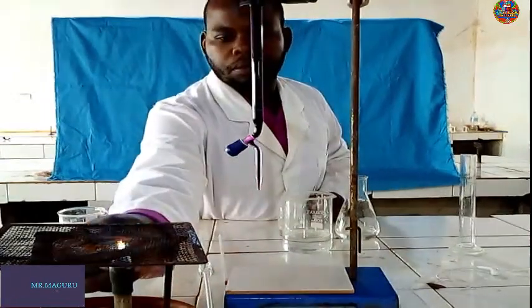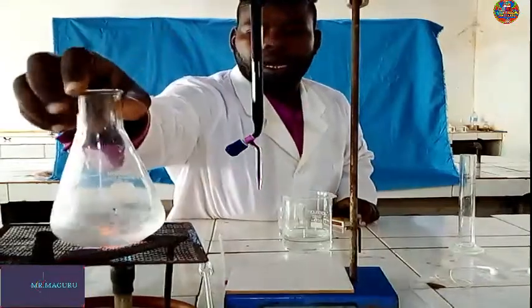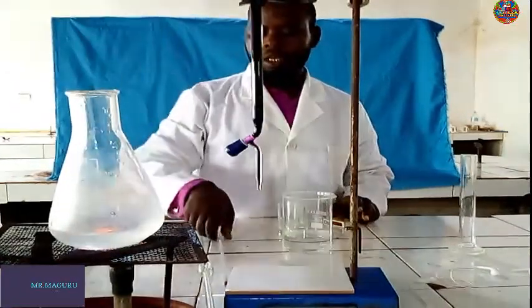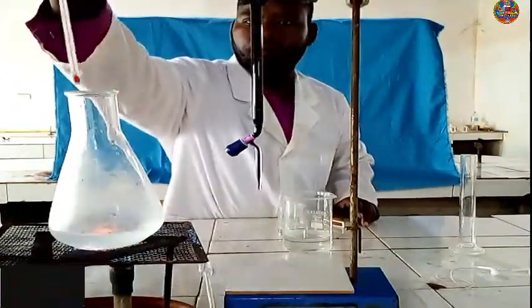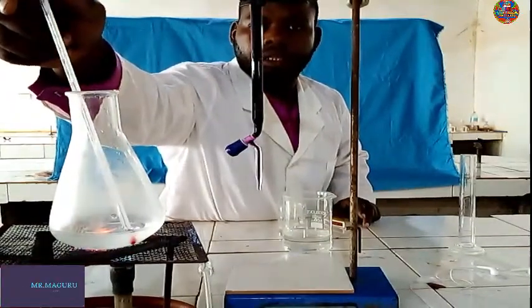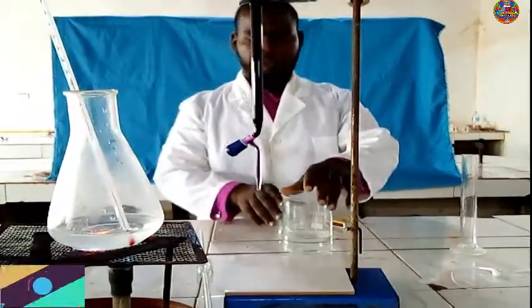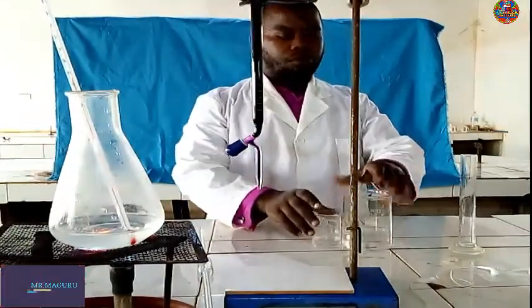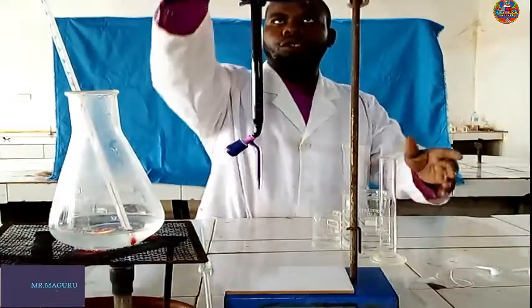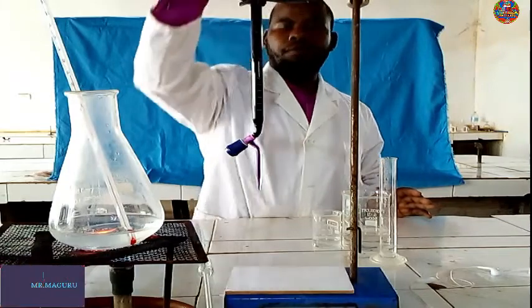Then we are going to find the temperature, about 70 degrees. I put this in, then we are going to wait. While we are waiting, we have to read the initial volume.